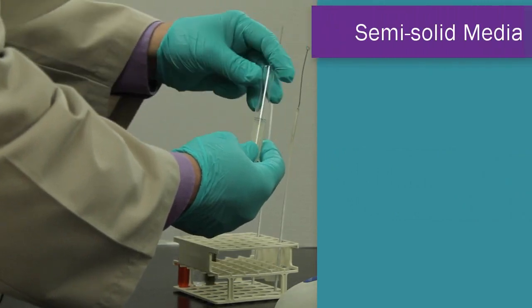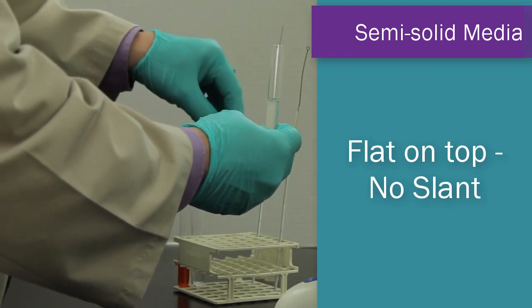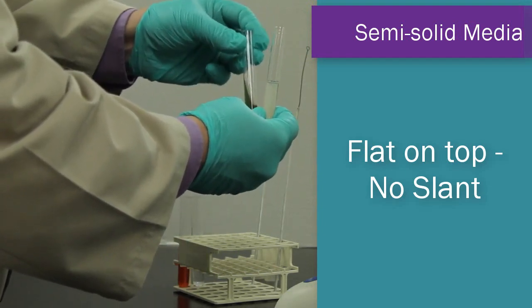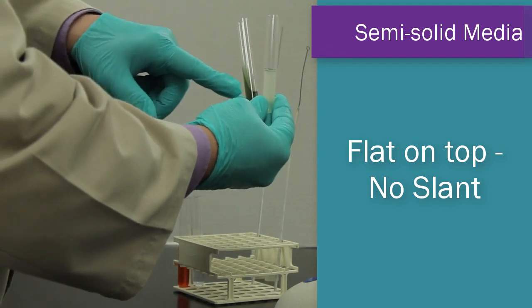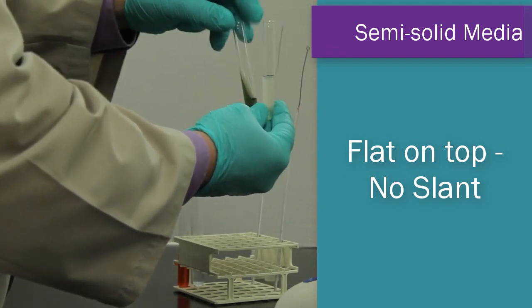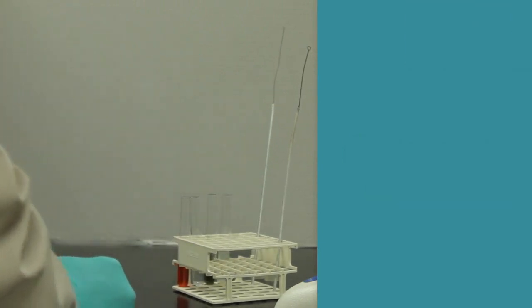The next type of media that you'll be using is a semi-solid. Semi-solid can be identified or distinguished from the solid media because the semi-solid is just flat on top, whereas the solid media has the agar slant. So those are the three types of media you could be using in the microbiology lab.